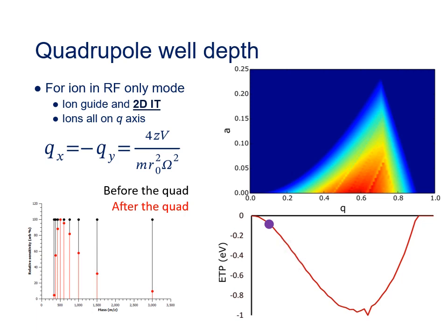Therefore, if you find you need to improve the sensitivity for some high mass-to-charge ions, one strategy for doing this is to increase the RF amplitude. Because Q is proportional to V, as you increase V, you increase Q, so you can bring these high mass-to-charge ions into a deeper part of the trapping well. Of course, it's no good doing that for ions that are already trapped, because the sensitivity is locked in by that point. But the next time you fill the trap, you'll now be filling those high mass-to-charge ions into a deeper trapping well, so your sensitivity will improve.